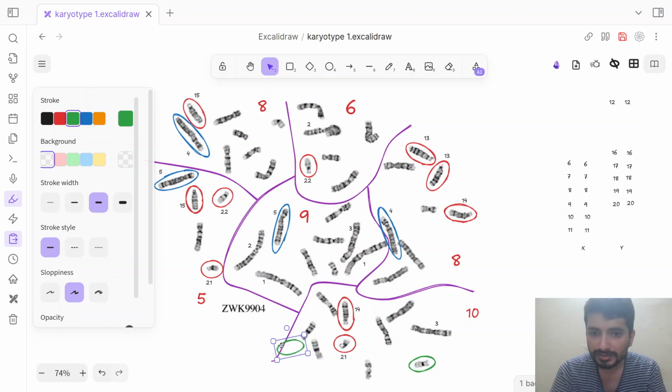and let us take it to this one. Again, this appears to be metacentric, and yep. So there are two more to go. There's one over here, one more, just one more to go. Can you find it? Yeah, it's over here.